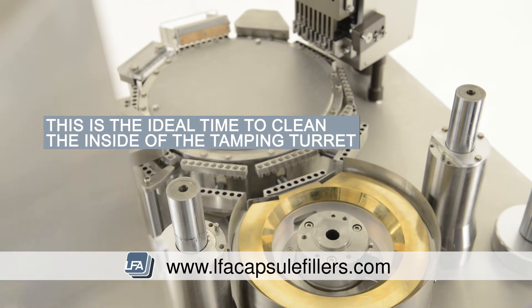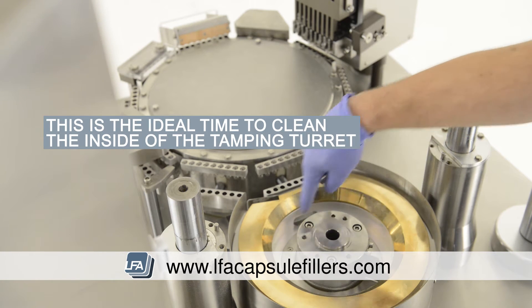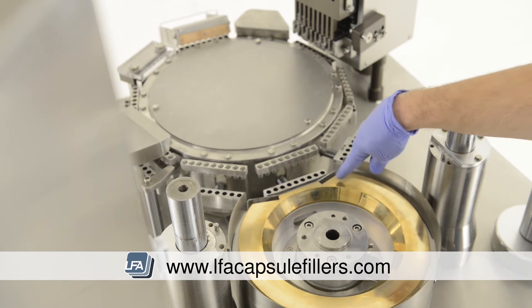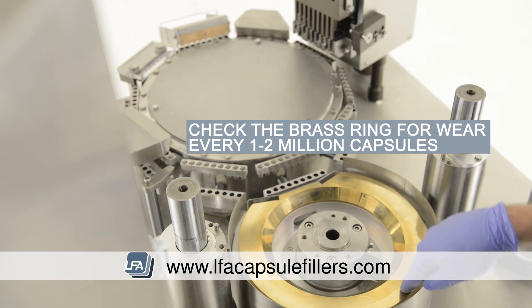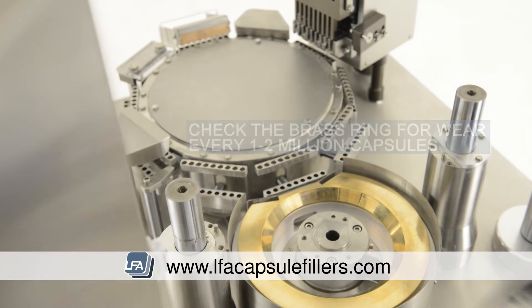Whilst you're in this section of the machine, we suggest cleaning the inside out. Whilst the FACF does have a paddle that pushes out reject powder, if your powder is fine, it may stick around the edges. Also, it's advisable to check the wear around the brass ring. We suggest doing this for every 1–2 million capsules, especially if your powder is very coarse.